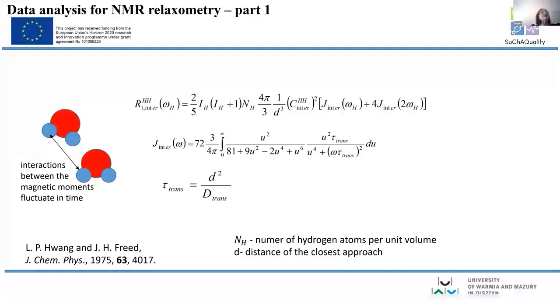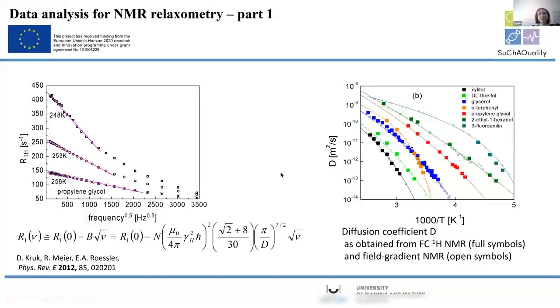food products. Actually, I have to tell you that maybe you know, but some of us together, in some papers, we made a series of papers in which we used NMR relaxometry to investigate relative translation motion of water molecules in various food products. We didn't apply it so far to sugar products, but this thing is real. We'll come to that.